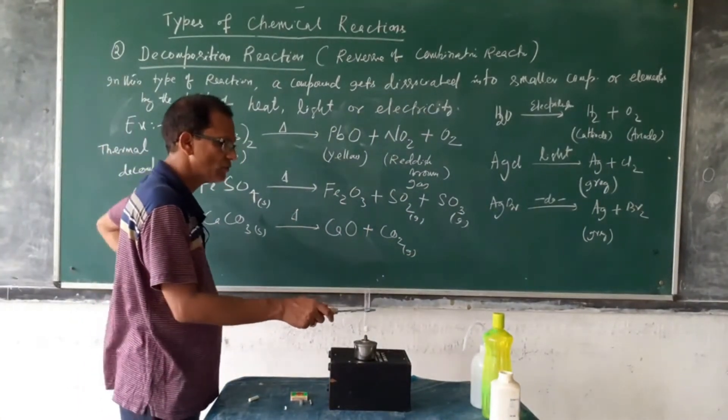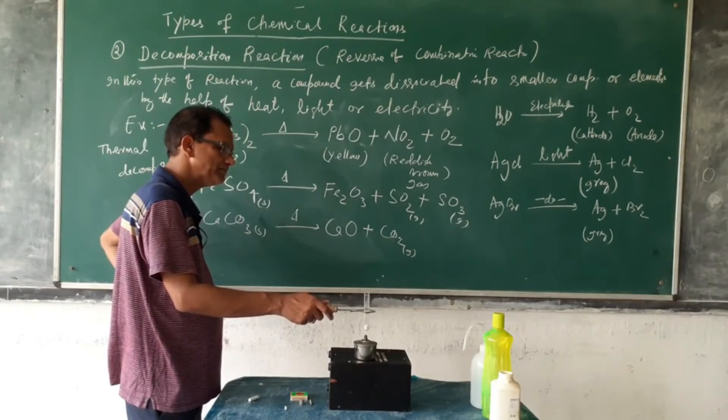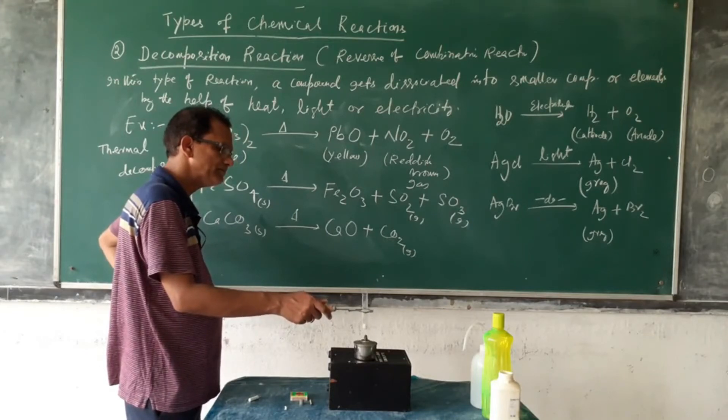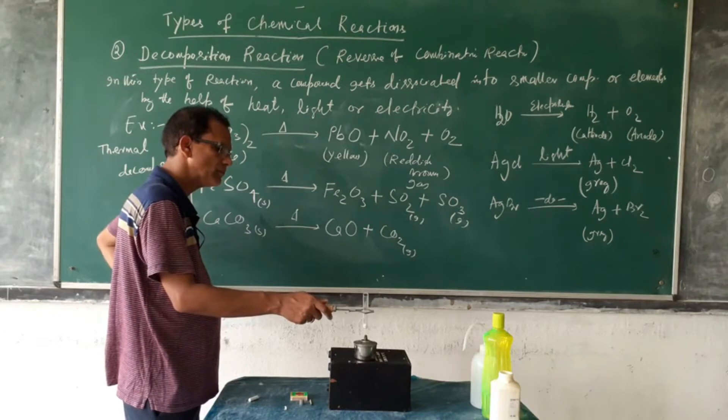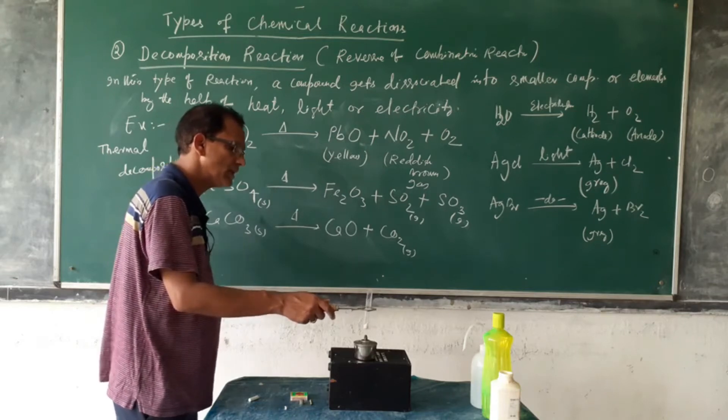You see the change. What change is observed during heating. When we heat the nitrate strongly. Then you see the observation. Careful.